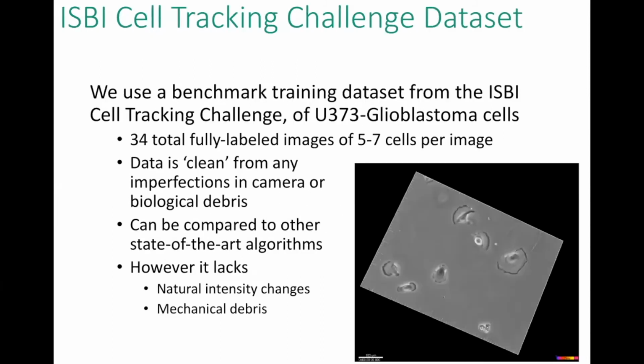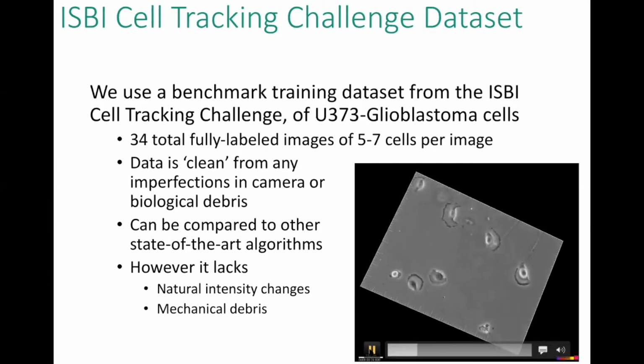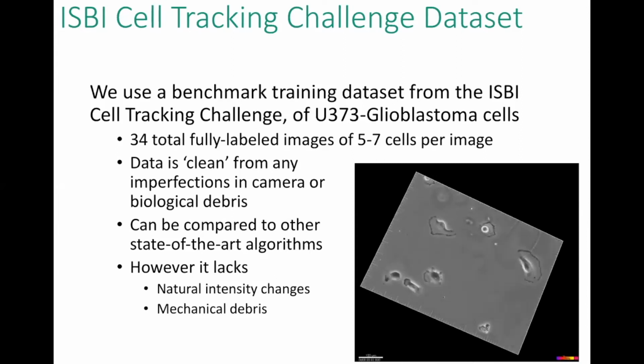Okay, so we're going to start by discussing the data sets that we use. One is one of those benchmark data sets that I mentioned earlier. This is from the ISBI cell tracking data challenge. And these are glioblastoma cells plated. I've played the movie here. You can see that there's a bunch of little cells moving around.